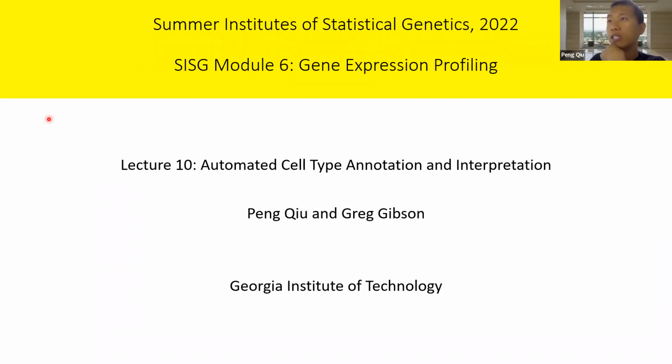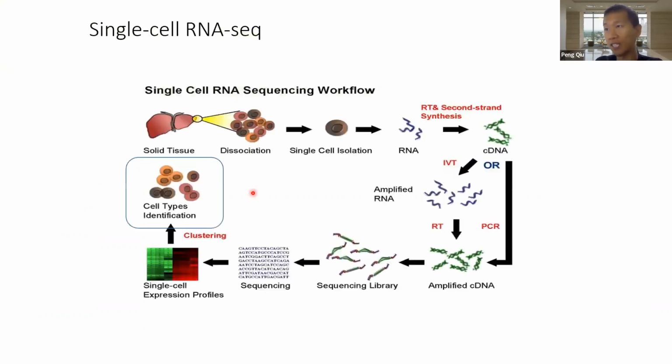All right, so in the last lecture, I want to focus the attention on the very last step of the computational analysis pipeline for single-cell RNA-seq. So this, again, is this overall pipeline that we have gone through. Once we have the gene cell count matrix, we've performed clustering analysis to get cell clusters. Then often the next step is biological interpretation of the clusters we get.